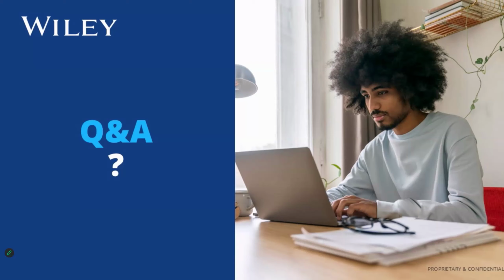Great explanation. Thank you very much, Michelle. Here's another one, sort of related. Is the new Trendfinder applicable to Raman databases? Yes, it is. For Raman databases, you can use a similar process as for IR, which will be demonstrated next week. No, next few weeks, again. Yes, you can use that to find interesting trends in Raman.